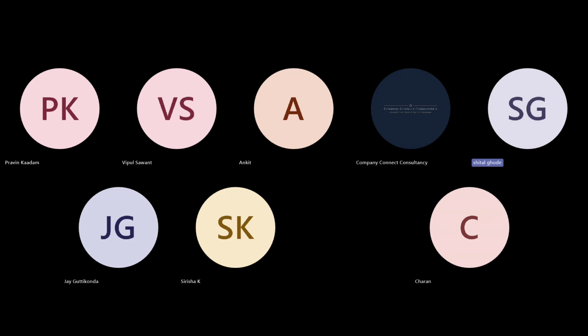So we enter the things, and then simultaneously enter them in the LIMS. Suppose raw material comes, then we will enter in the logbook, and then again we will enter in the LIMS, right? Or suppose one material comes, directly we enter in the LIMS and it will be saved as a log. I think Charan can help me here.